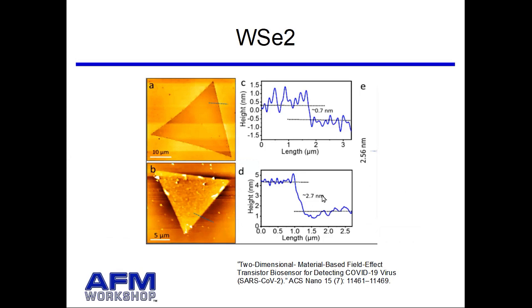Now, one of the things I want to point out in this image, and I'm going to talk about quite a bit here in a little bit, is that getting substrates which are very smooth for these kinds of measurements is very important. If you take a look at this, this seeming noise here is not noise, but has to do with the fact that the surface of the substrate is not that smooth. A lot of times these substrates have an Sa value of about 200 picometers. So if you have 200 picometers, sometimes it can hide the height of the features on the surface. I'll talk about that in a little bit.